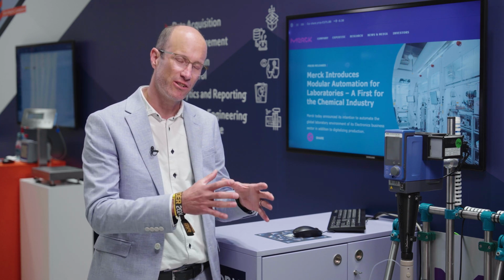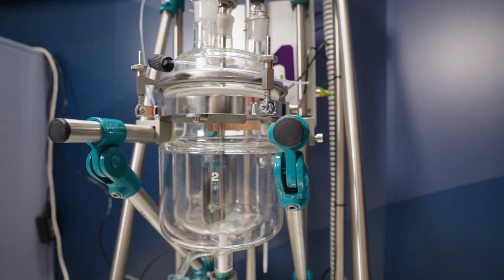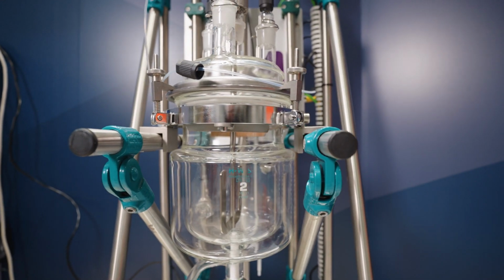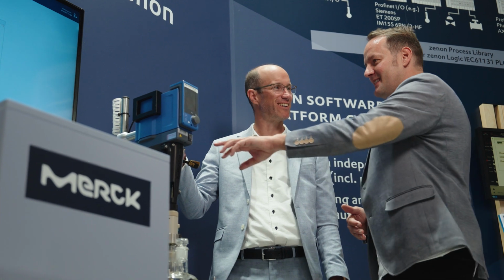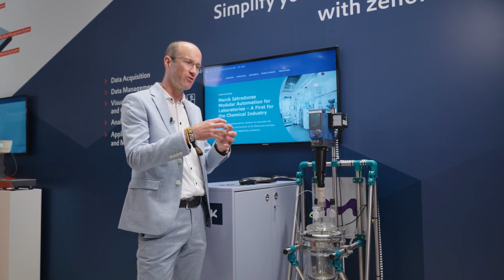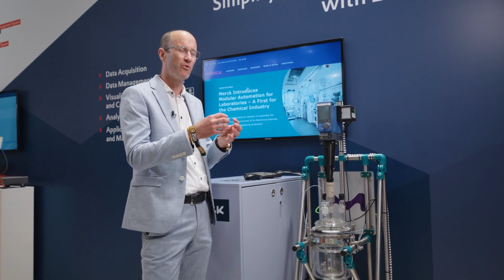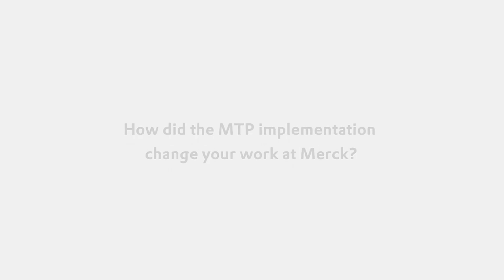The important thing is having the possibility of starting to create recipes through a whole process and connecting different kinds of modules to leverage the potential of automation and also digitalization of the process. This is very crucial. And the MTP enables you to have a clear definition of what your modules can do. So you get the offering of services and procedures, and this can be used for building a little bit like a digital twin of your process. So you can start to think in a digital way: how would I connect different kinds of modules?